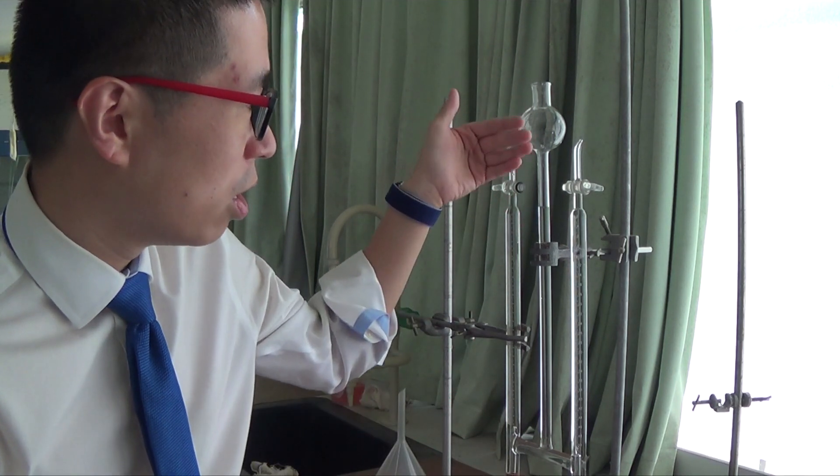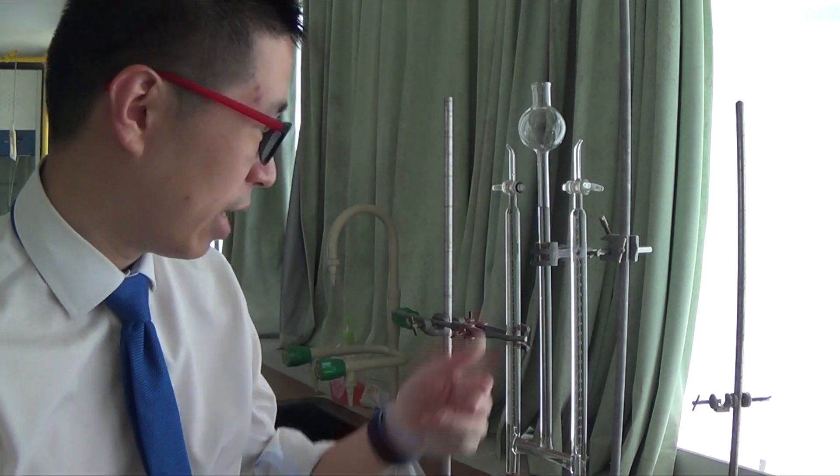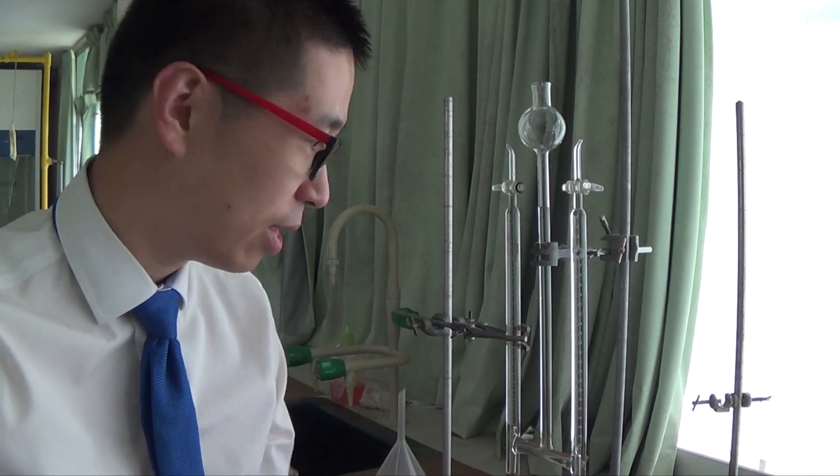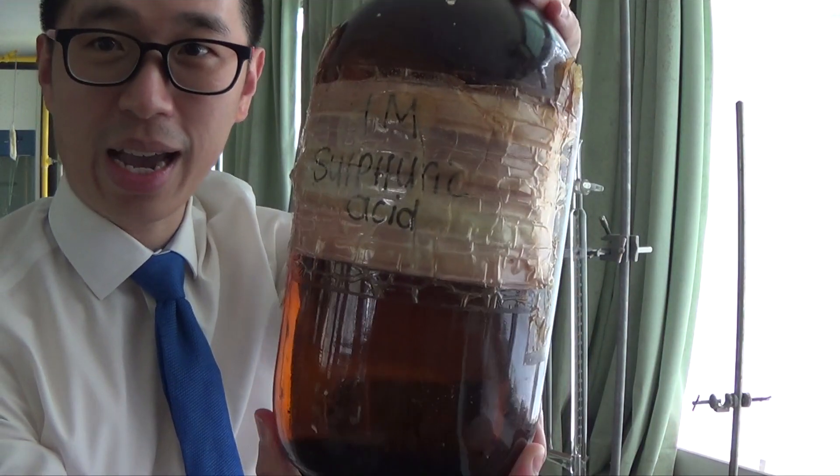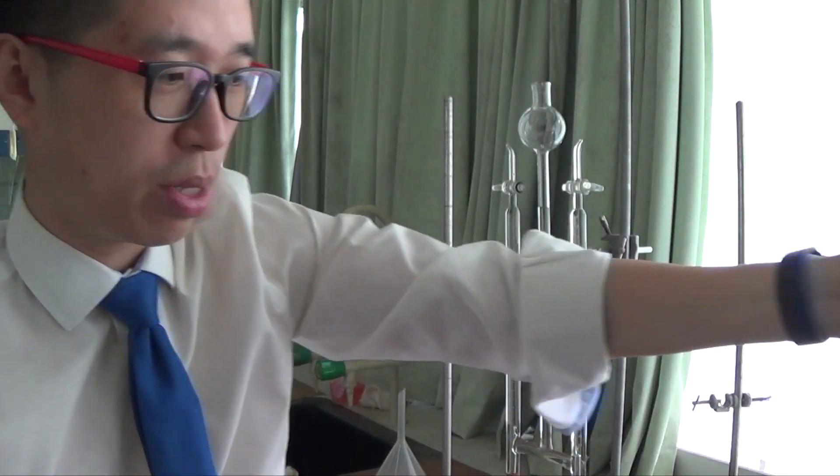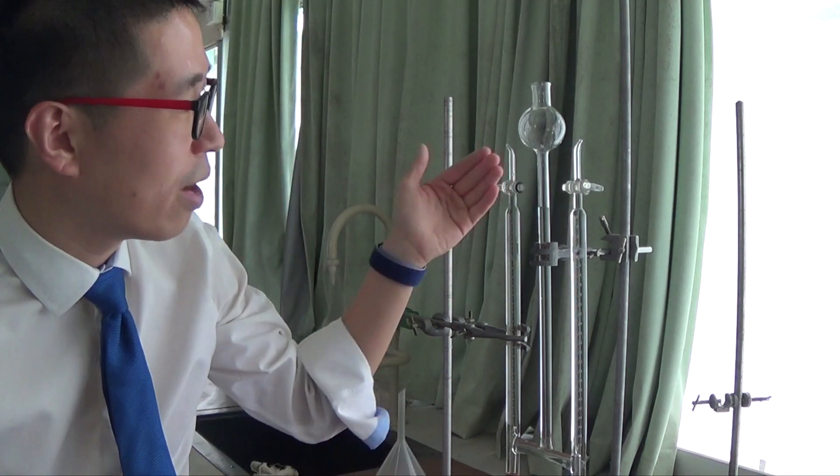This is something called a Hoffman voltammeter. It's basically an electrolysis setup. I have an electrolyte which is 1 molar sulfuric acid, so 1.0 mol per dm³ sulfuric acid. Sulfuric acid is our electrolyte. So it's the stuff that we are trying to electrolyze.